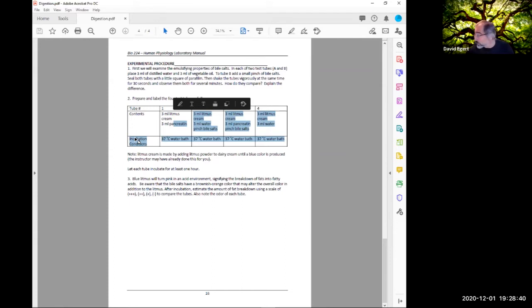So what I am going to do now is first make sure there are no questions. Are there any questions about what you are about to do? What do you mean by a pinch of bile salts? It's just this stinky brownish powder that you add. It's an emulsifier. Bile salts are the emulsifier.